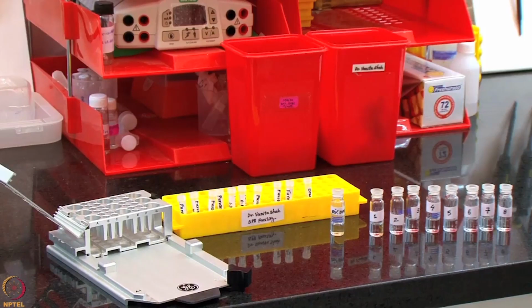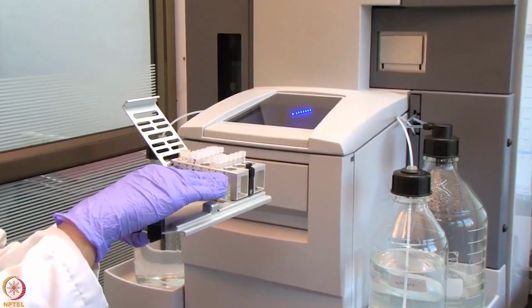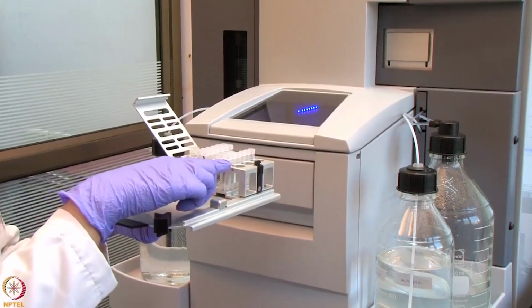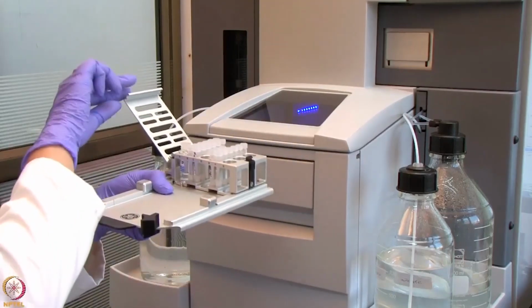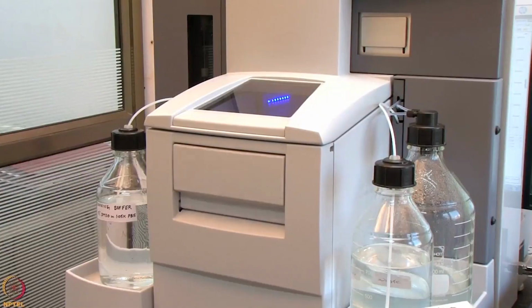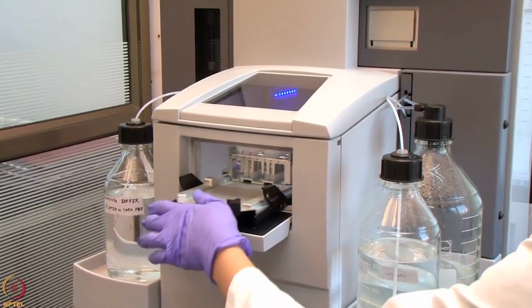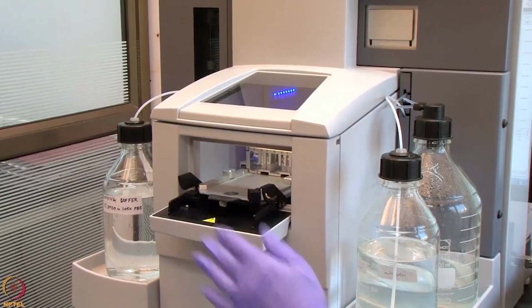We have now placed all the tubes inside the rack, including the wash solution, the furosemide samples, the startup and the solvent correction solutions. Now we will place this rack inside the system to start with our kinetic assay. We will now start with our run as demonstrated in our earlier lectures.